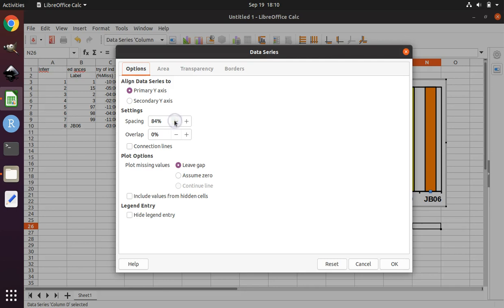So just go down a little bit. Now don't get overly enthusiastic and click 1,000 times, because then the machine will get jammed and you'll be waiting for the machine to get caught up with all of your clicks. At least that's how it is on my virtual machine. On a real Linux machine, you may not have these limitations. But the best thing to do is to just slowly click your way down to 0% by hitting the minus button over and over. And don't get too far ahead of your clicks with what you see on the screen.